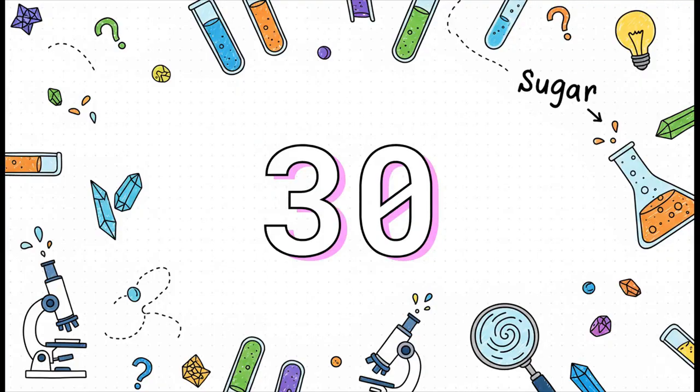Just like before, our stopwatch is our best friend here because this test is all about speed. Here's the deal. Ketoses, like fructose, react way faster under these test conditions. They produce this incredible, bright, cherry red color in under 30 seconds. If you see that happen, bam, you've got a ketose, no doubt about it. It's an incredibly fast and decisive clue.